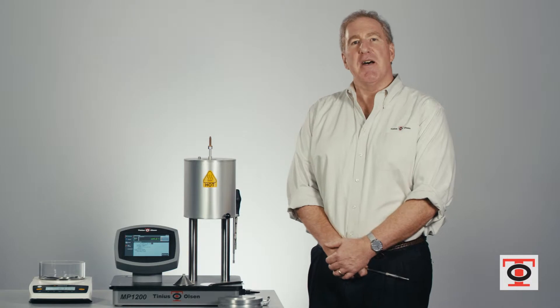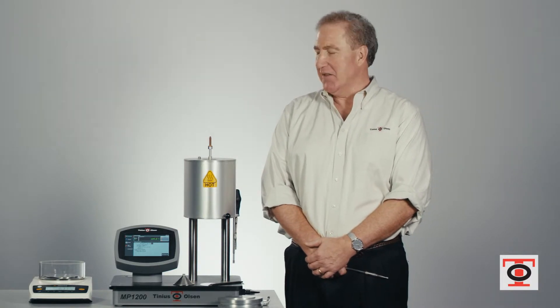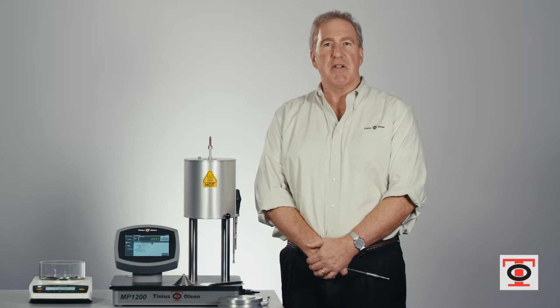What's shown here is the base model MP1200. It's designed to do method A testing according to ASTM D1238 and ISO 1133. The standards are pretty much the same. If you want to do an ISO test you need to have a little different hardware — a different piston foot and different piston rod — and you have to do a little different programming. But for our discussion today we're going to focus on ASTM D1238 and do a procedure A test.